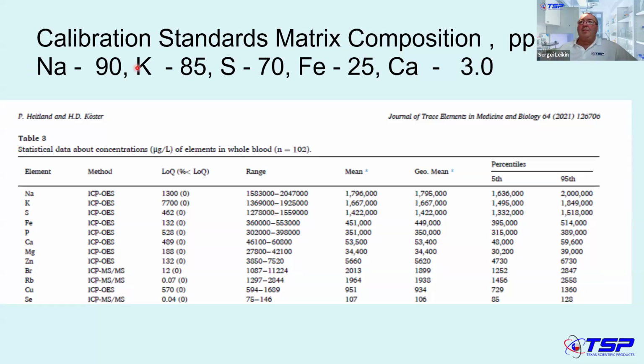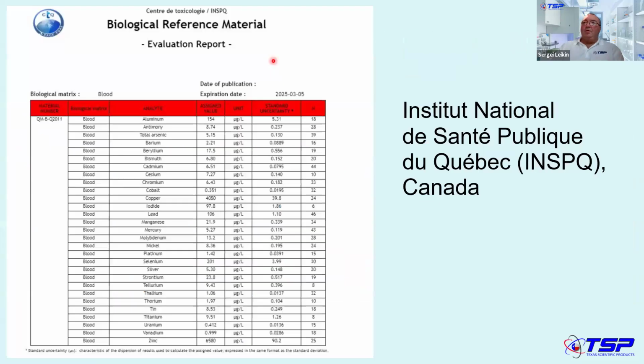And this is how we came up with a few elements for a sort of synthetic calibration standard. Let's say 2,000 divided by 20, that's 100. So we went a little bit lower, to be in the middle, closer to the high end of the range. That's how these matrix match standards were created. Then we took a reference material that was available and ran the analysis.